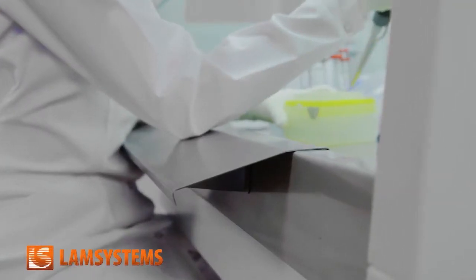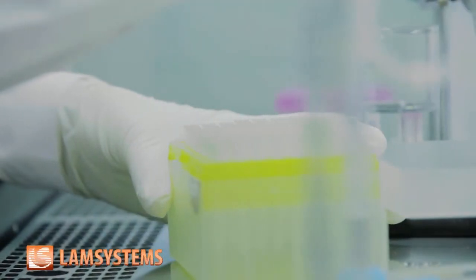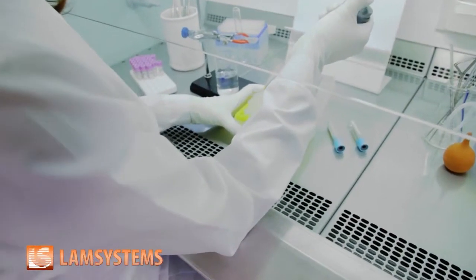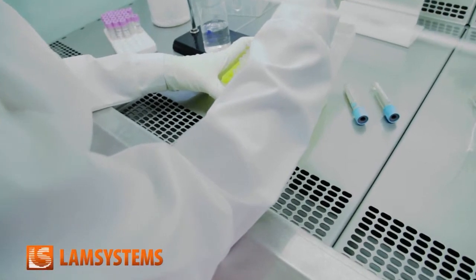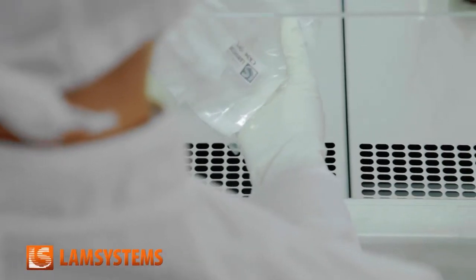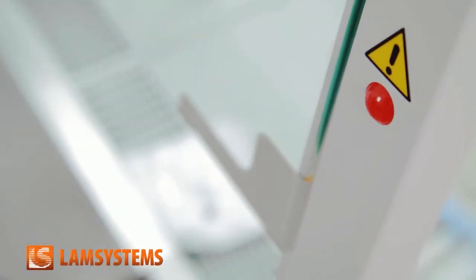If the personnel use a special armrest, it certainly makes their work easier, but they still should control the condition of the front air grill for the whole period of operation. Assume that the operator, deep in work, doesn't notice that the air grill is covered with something, his sleeve, napkin or package, it doesn't matter. The main thing is the result, the protection is broken.